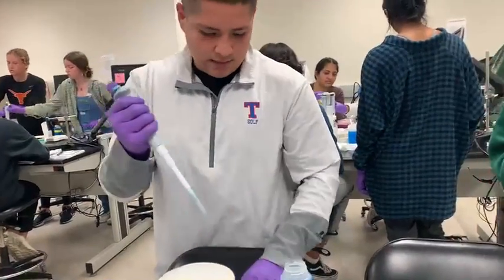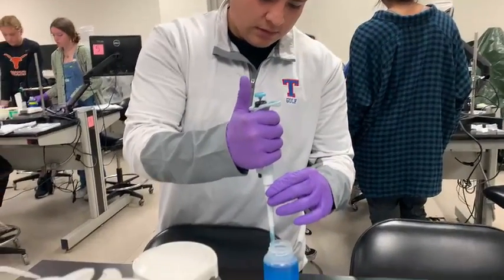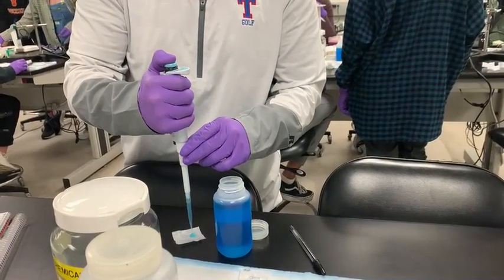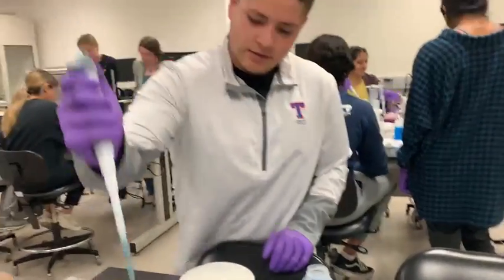Then go down to the first stop as well. Put it in, slowly release. And then go back down to the second stop. Make sure it's all off and be checked.